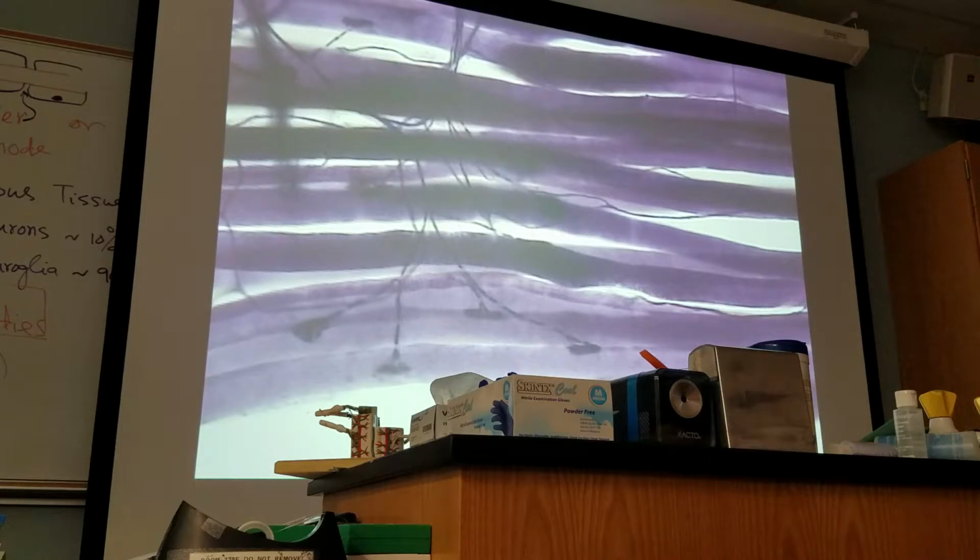When you study the nervous system, the peripheral nervous system is divided into the autonomic nervous system, somatic nervous system, and enteric nervous system. So this is a part of the somatic nervous system. I can ask you to identify as indicated the node of Ranvier, the synaptic end bulb, and the region, the neuromuscular junction.